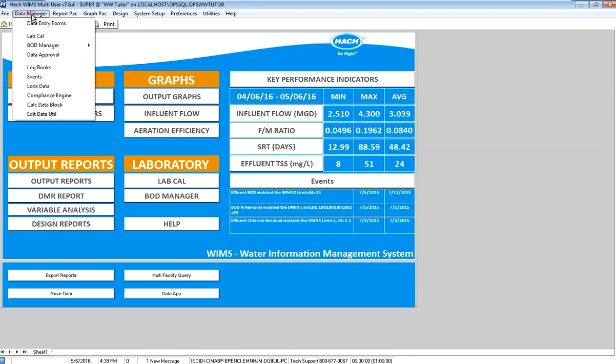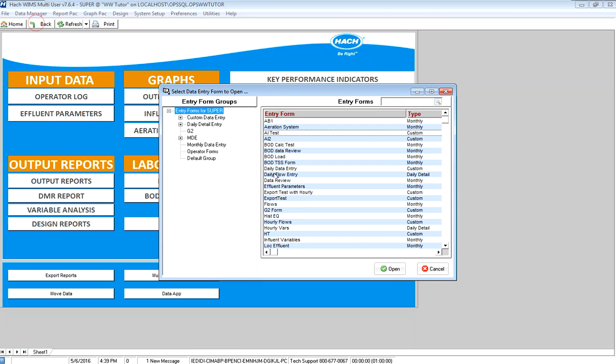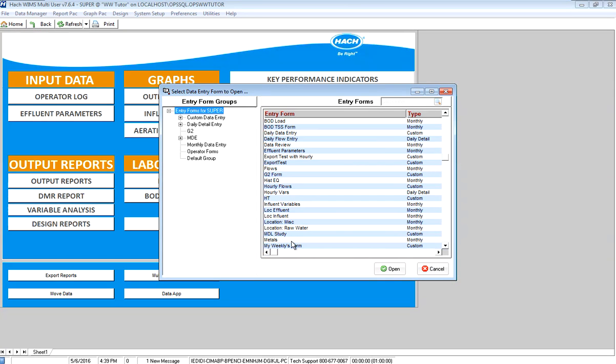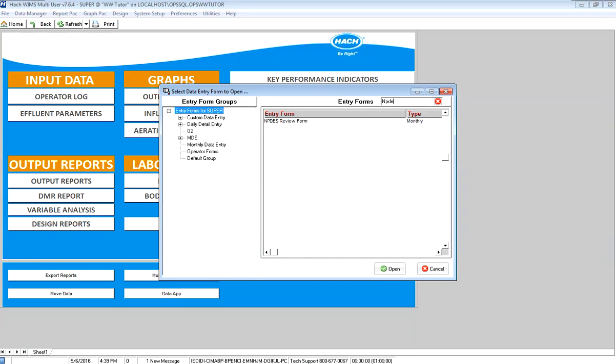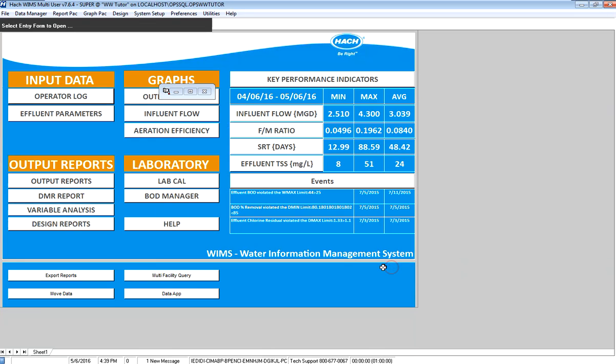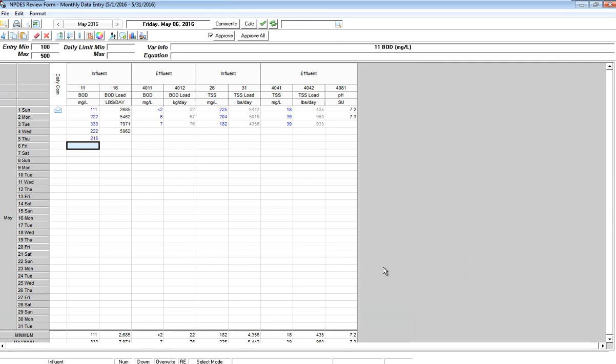I'm going to go to Data Manager, Data Entry Forms. I have a form called NPDES Review Form. I'll use my quick filter to find it and open that form up. Here I have a form that shows me the parameters on my DMR report: Influent and Effluent BOD, TSS, and then my pH.